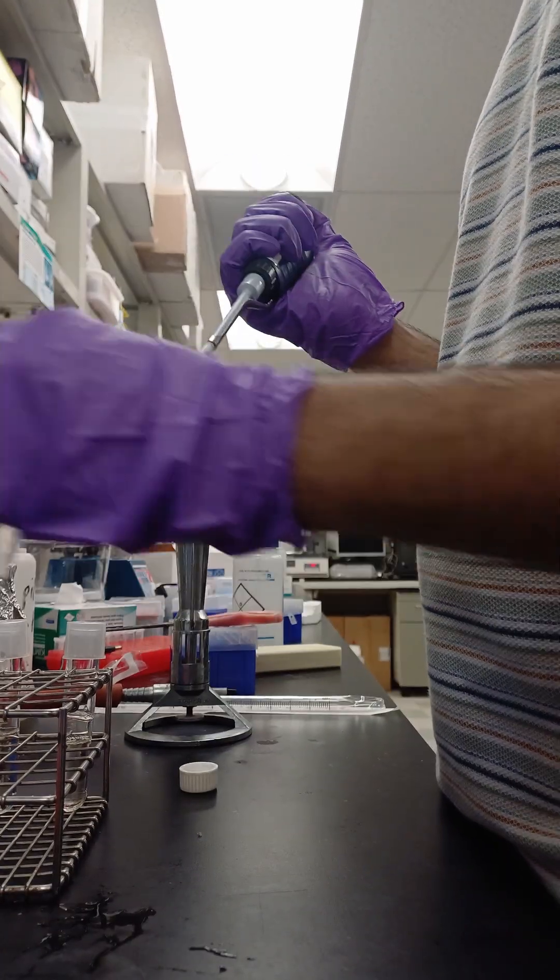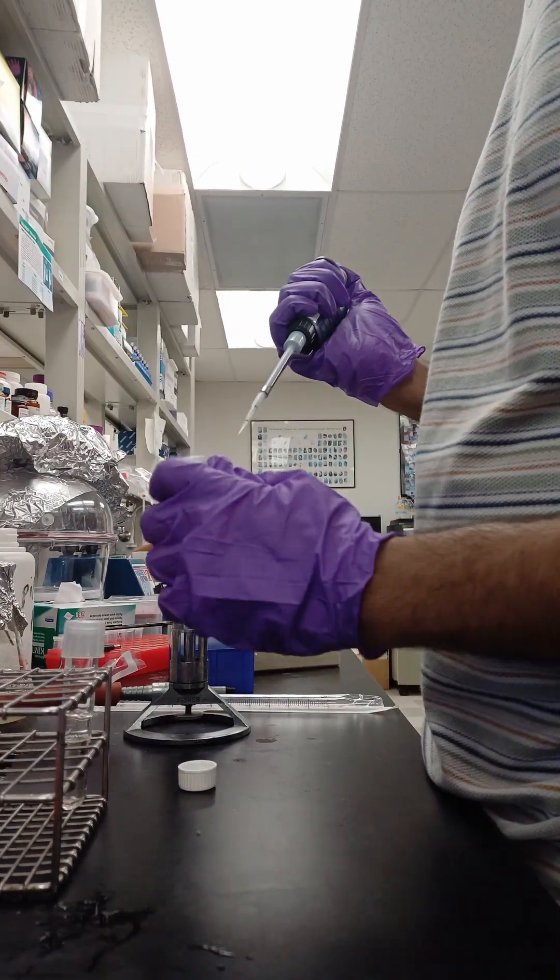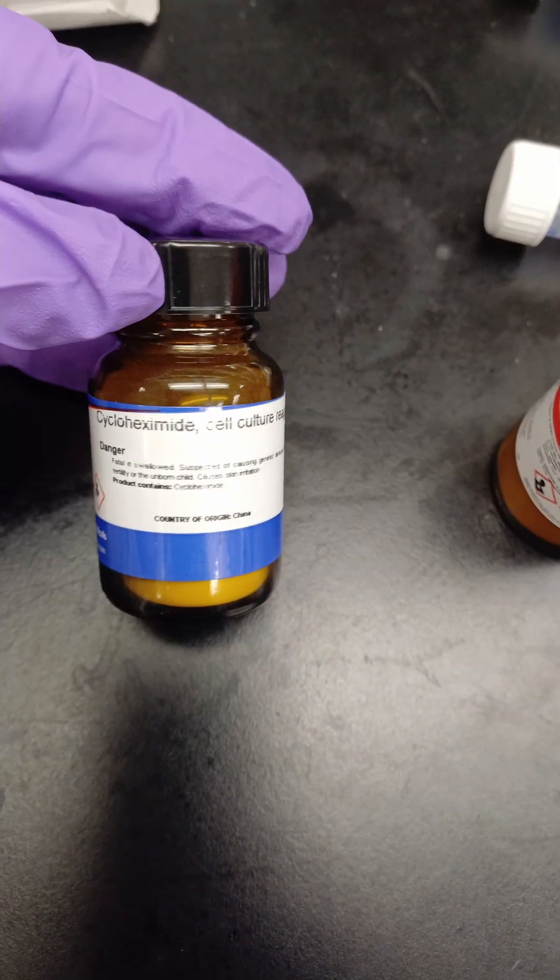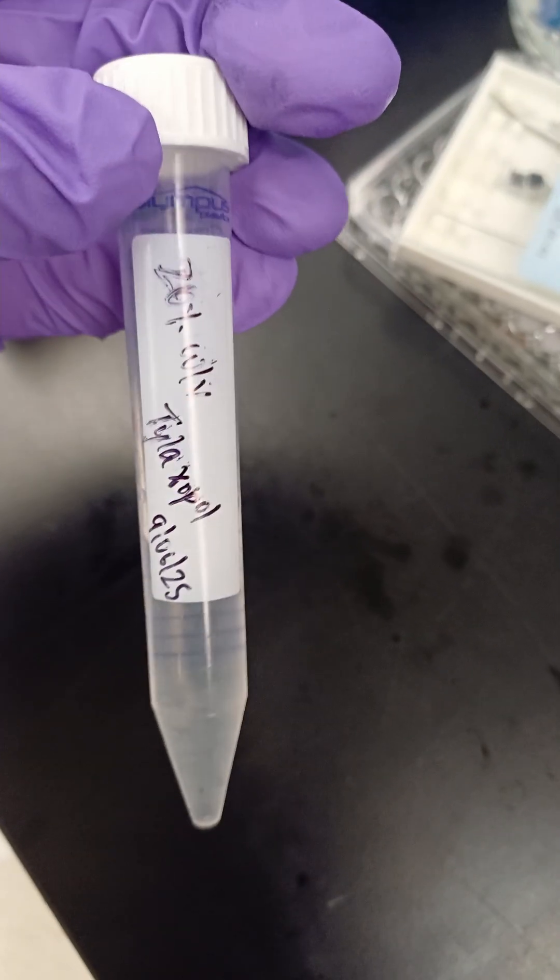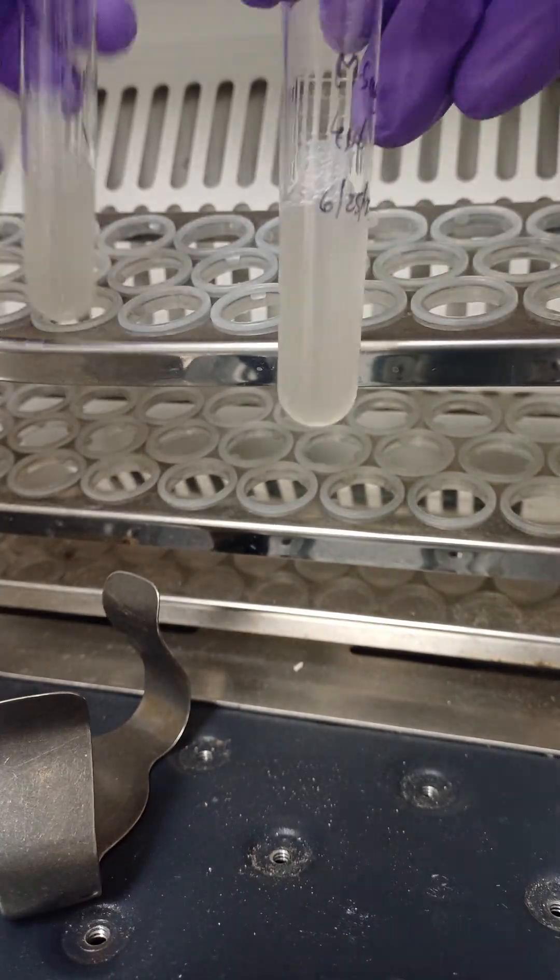I add cycloheximide, which is an antifungal agent, carbenicillin, which is an antibacterial agent, and Tween-80, which prevents clumping of the mycobacterial cells during growth.